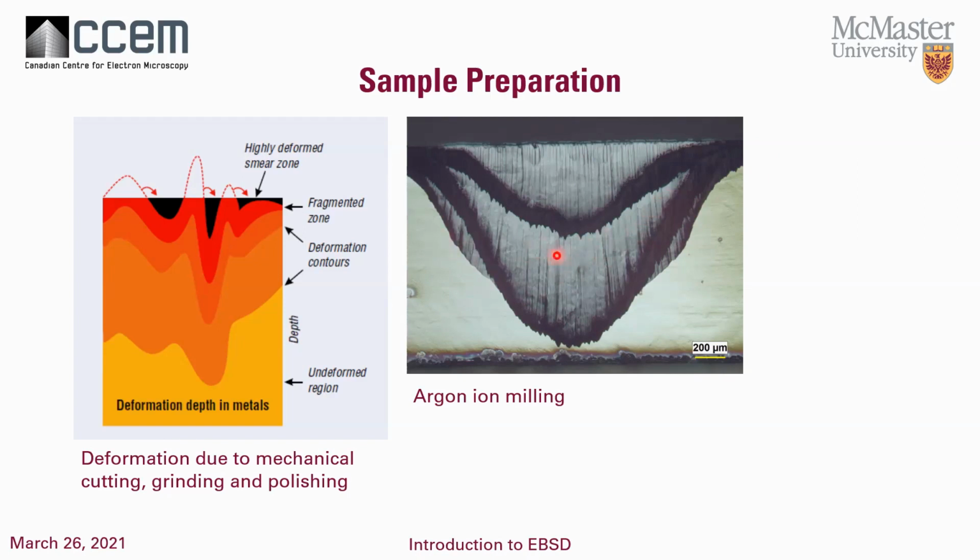So we do have some topography, but we are getting a very nice crystal structure exposed by the actual preparation technique. So you may have to do ion milling at 1 kV and then go to ion milling at a lower kV to see if you can reduce the amount of curtaining present.